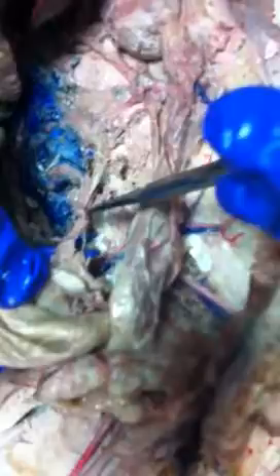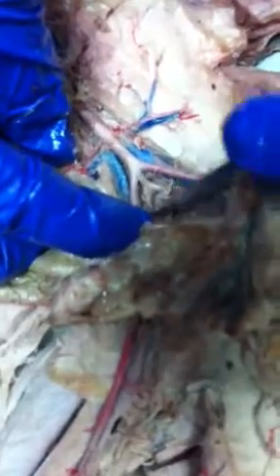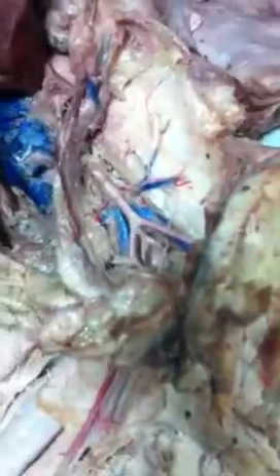Then we have inferior mesenteric. And you can see this coming up all the way to the colon. See that? Iliolumbar artery runs with the iliolumbar vein. And we will terminate the dorsal aorta right there by bifurcating into 2 external iliacs, and the 2 internal iliacs are inside. Questions?